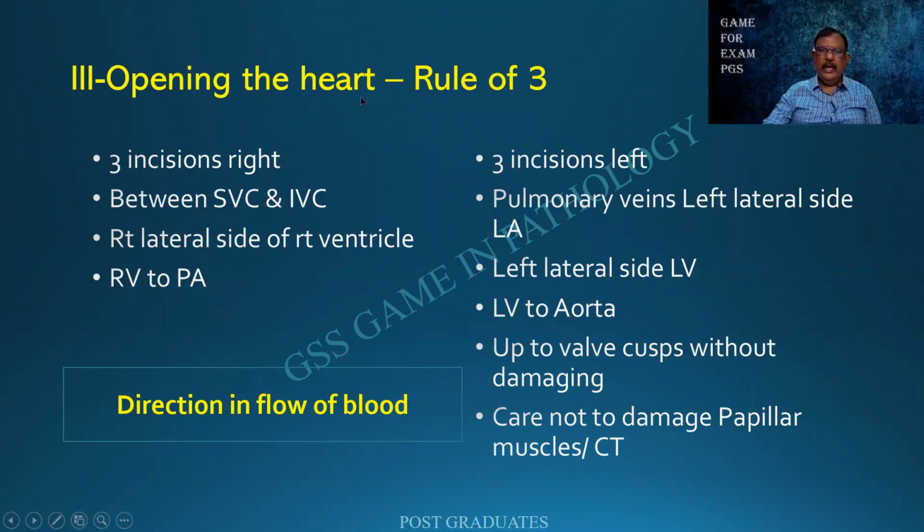But before that, I would like you people to kindly memorize this list. I created my own mnemonic, the rule of 3. There should be 3 incisions on the right side, 3 incisions on the left side. First will be the right side. It has been mentioned that it should be in the direction of blood flow.